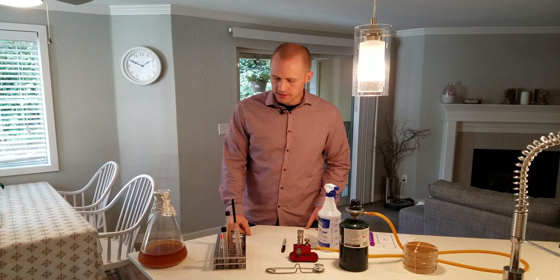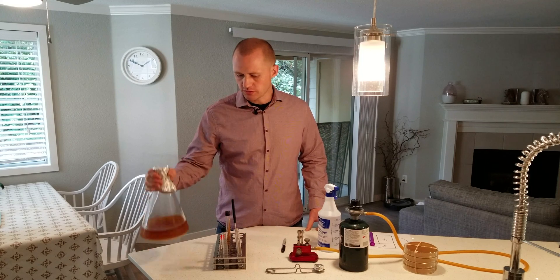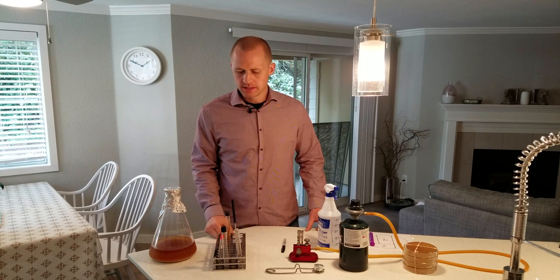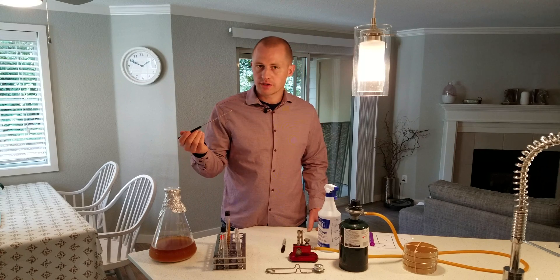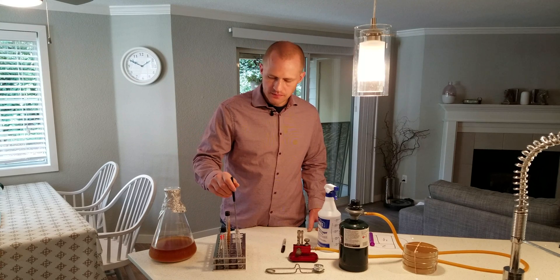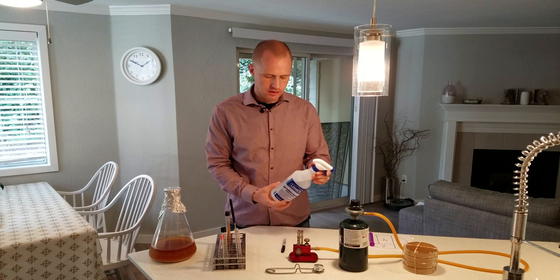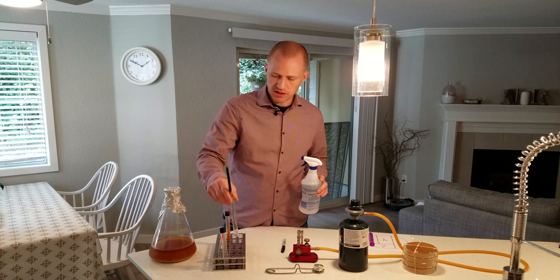What you'll need is some sort of yeast sample. In this case I'm going to use a Hefeweizen yeast that I have in the bottom of a starter. You also need a loop that we're going to use to collect the yeast. I like to have it sitting in isopropyl alcohol — I just took a test tube and poured some in the bottom.